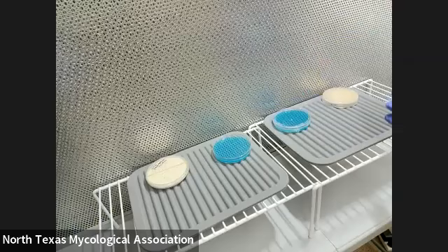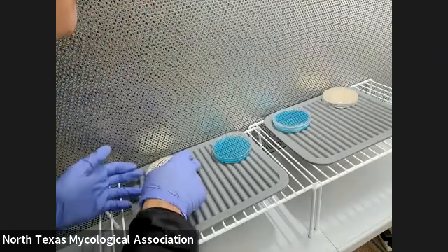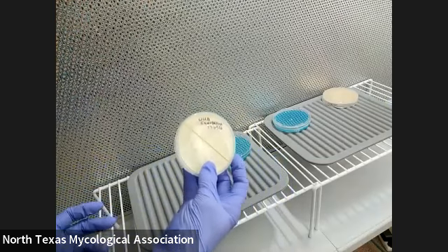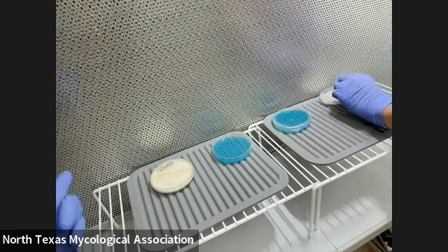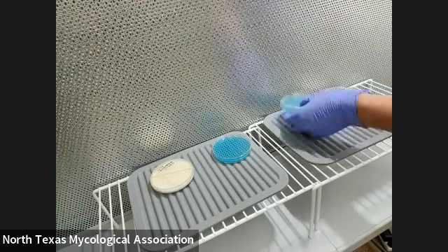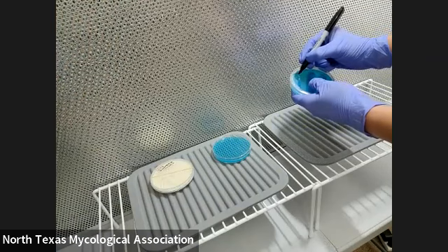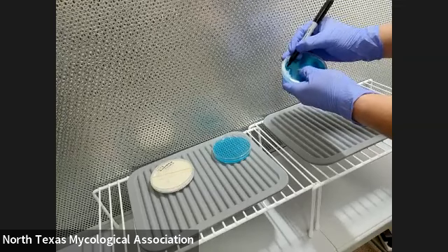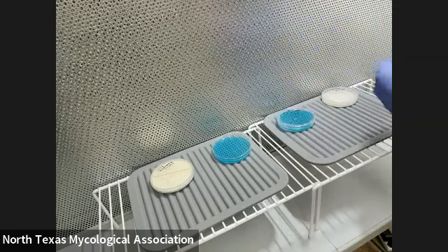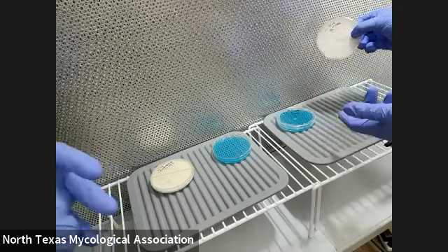We're just going to label it. That one was the blue oyster. And this one is a wild Ganoderma that we found — I think it was a few months ago, at the first foray. People have different ways of labeling their plates, but I like to just put the common name because I don't want to bother with the scientific name. Blue oyster, the date is 2/5, and the transfer number is T2 — transfer number two. This plate was transfer number one, so this new plate is transfer number two. That's how you do it.